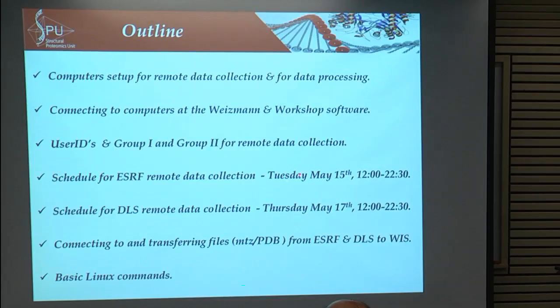The ESRF is on Tuesday, and on Thursday is the DLS, and we'll cover how we can connect and transfer files, MTZ and PDB only. Like we said, we don't want you to retrieve all the actual frames from your data collection, because otherwise we're going to be kicked out of the Weizmann Institute. We want you to come back here, so we won't do it this time. And then some Linux commands.